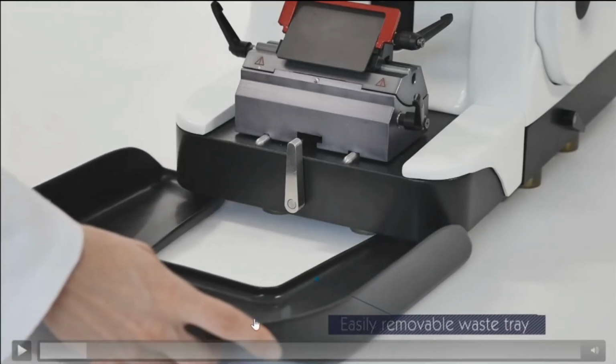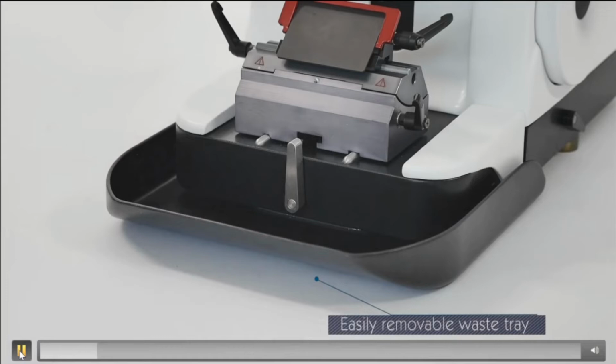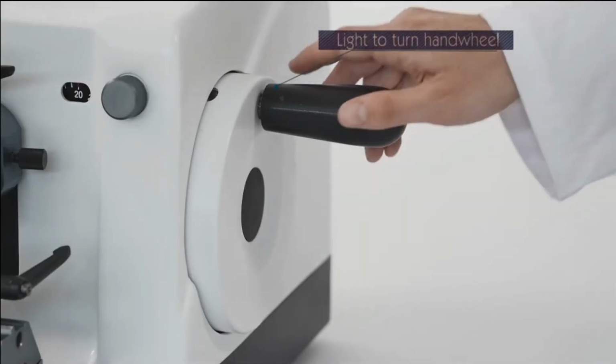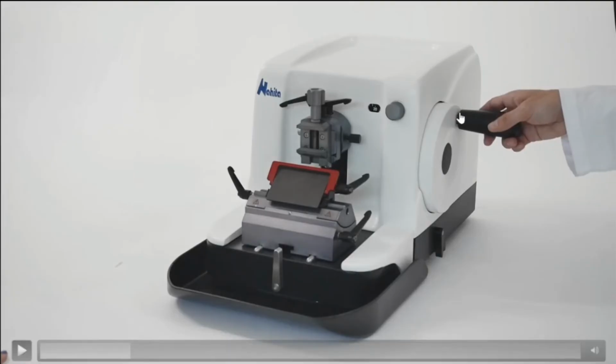Here is a tray for removing the dust and debris after the cutting procedure. This is the rotating wheel, and the opposite side here is not visible in this position.